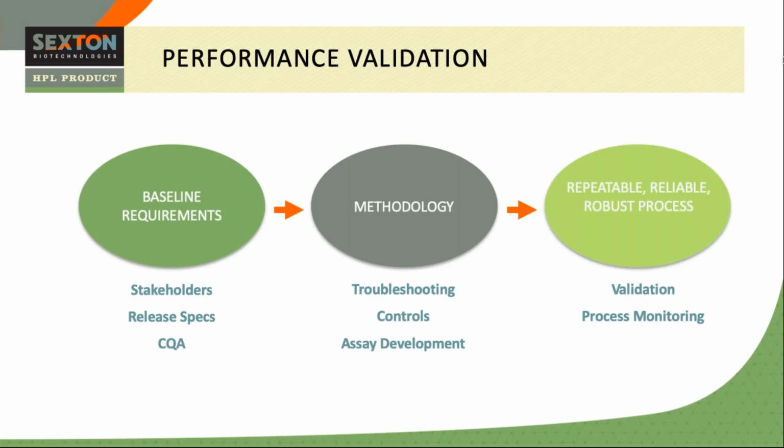Within these criteria, there's intravariability we must consider. How does cell expansion and phenotype vary between serum lots? Donor to donor consistency: how does cell expansion and phenotype vary between cell donors? Ultimately, here we're establishing a test method that produces repeatable and reliable results. Moving through to methodology, there's a requirement to begin to build test method specifications, identify process gaps, where to tighten controls of the process, how to reduce variability in the test method, begin to address raw material quality, cell line qualification, control serum qualification, and raw material specifications. Through these steps, we take all of the knowledge learned in pre-development and development to create a test method that will meet the necessary requirements in a validated manner.